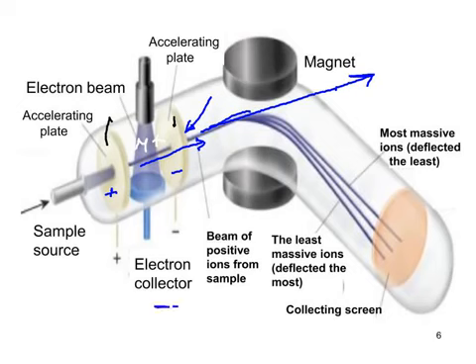Something extra it gives here is that while we have the electron gun here, firing electrons in this direction, the electrons don't just simply disappear. There is some material which absorbs the electrons at the bottom, the electrons that haven't struck anything. Indeed, we are aware that when the electrons strike a molecule, it actually creates a second electron. So there's an electron collecting device here.